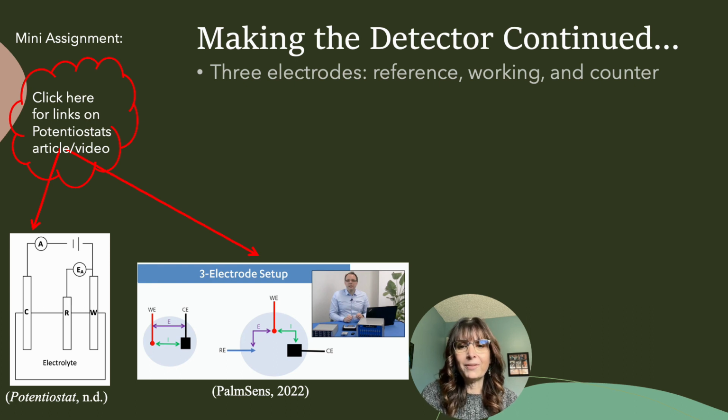All right, now that you're back with me, we know that a potentiostat, which is what these guys were creating, regulates voltage while measuring current. Typically, the current is measured and then correlated to something like concentration of the analyte, which is what Mohan et al. did. Their potentiostat has 3 electrodes.